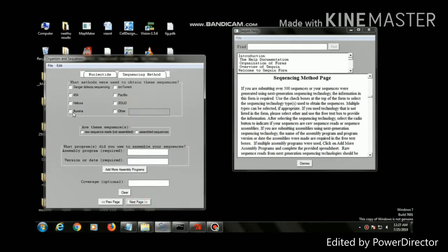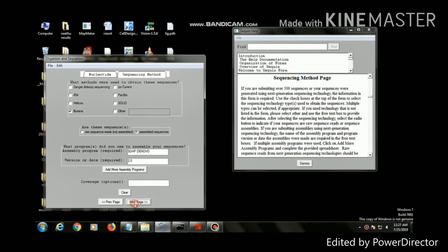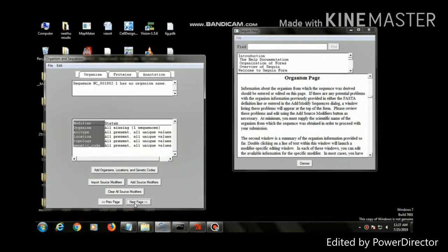What method were used to obtain these sequences? It is an Illumina method. Then click assembled sequence. Fill in the assembly program name and its version.